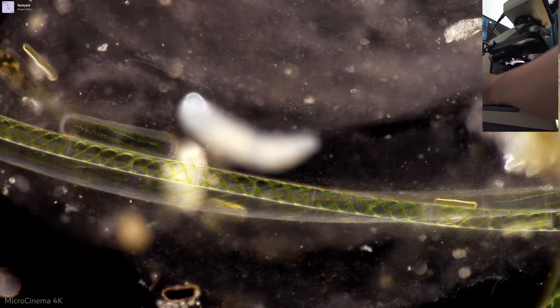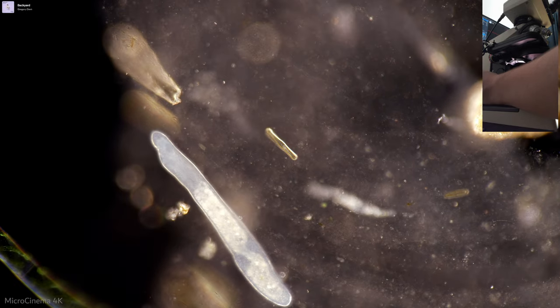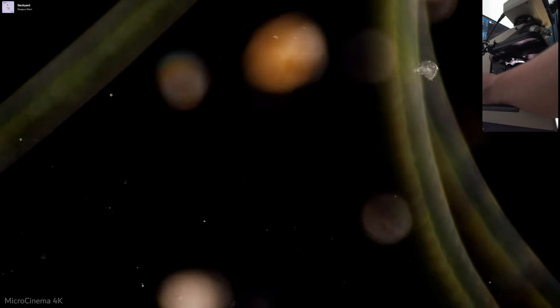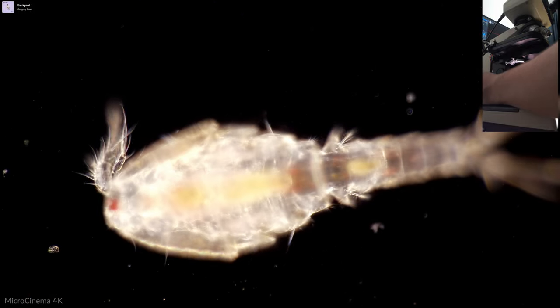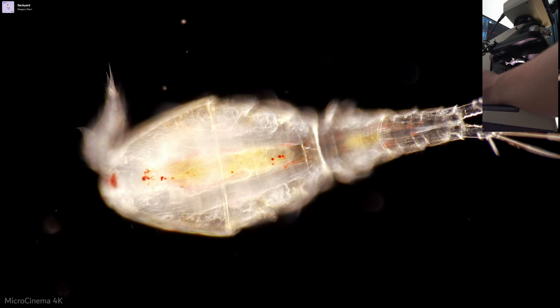Let's see if we can find our... we've got some little Zoid worms. Oh, is that actually, that's a Stenostomum right there. That's a voracious little predator. And let's see if we can find our copepod again. Yeah, here we go. And of course it just looks amazing.